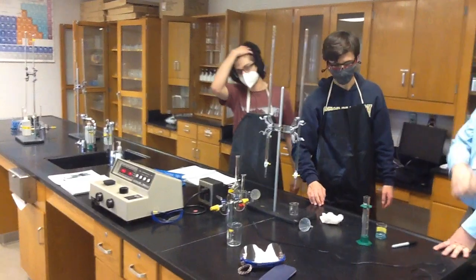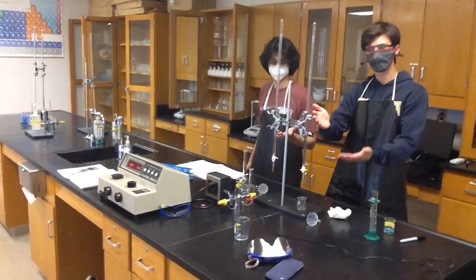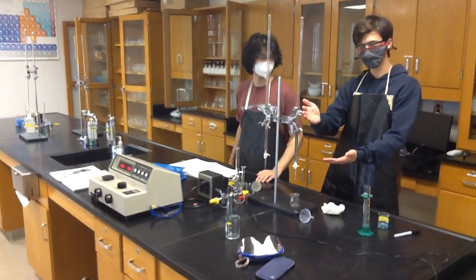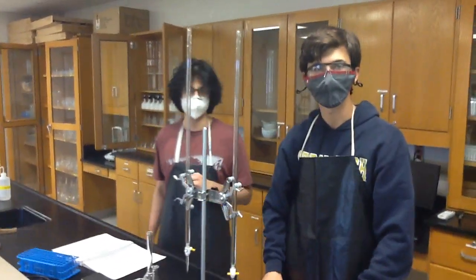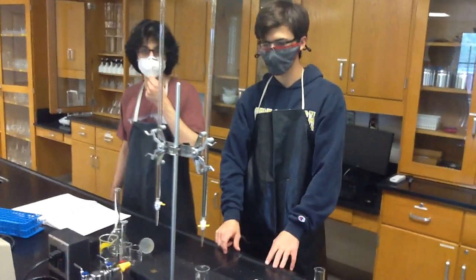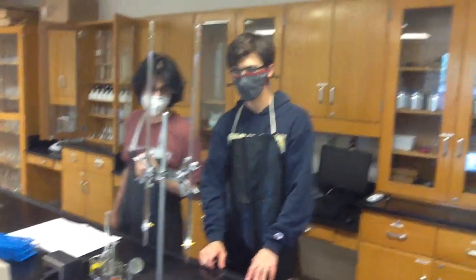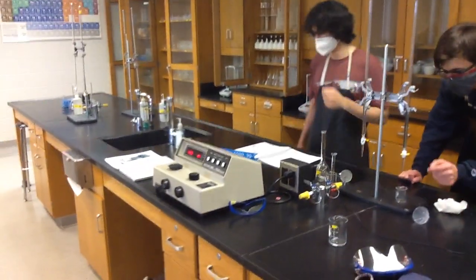So now they are working on doing their dilutions. We have two burettes, one filled with water, one filled with the 0.1 molar copper sulfate. Okay? And so how many different solutions have you guys chosen to make? Four. What concentrations? 0.1 molar, 0.06, 0.04, and 0.02. Okay? And so then they're going to use the burettes and mix those, and then test the absorbance of each of those in the spectrophotometer.